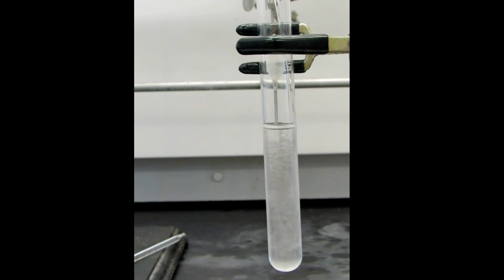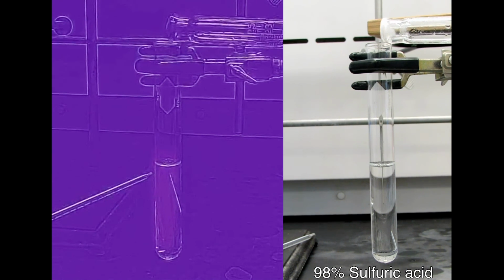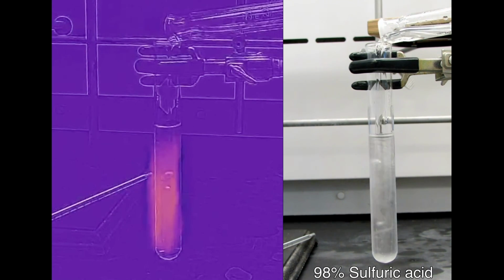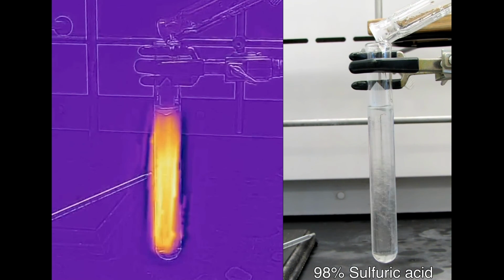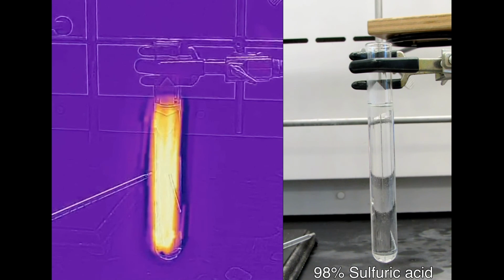Okay, how about adding water to acid? As a common rule, water should never be added to acid because the dilution of acid is very exothermic and can cause the water to boil and splatter. This is especially true for concentrated acids. Well, the solution definitely gets very hot and exhibits why acid should always be added to water and not the other way around.